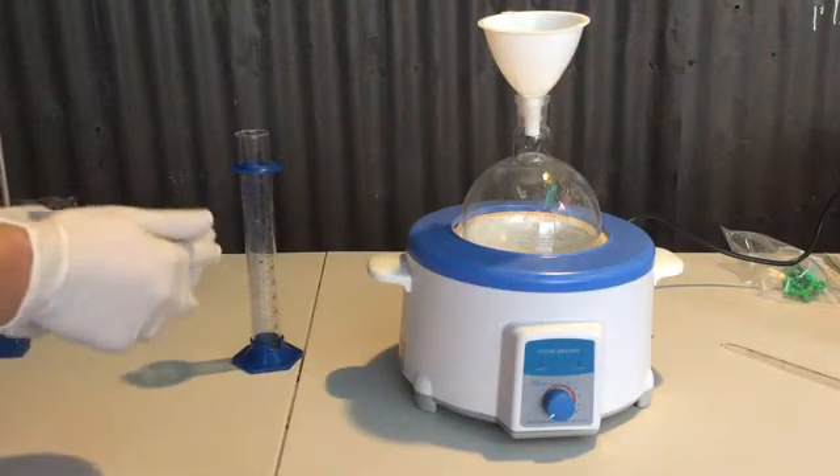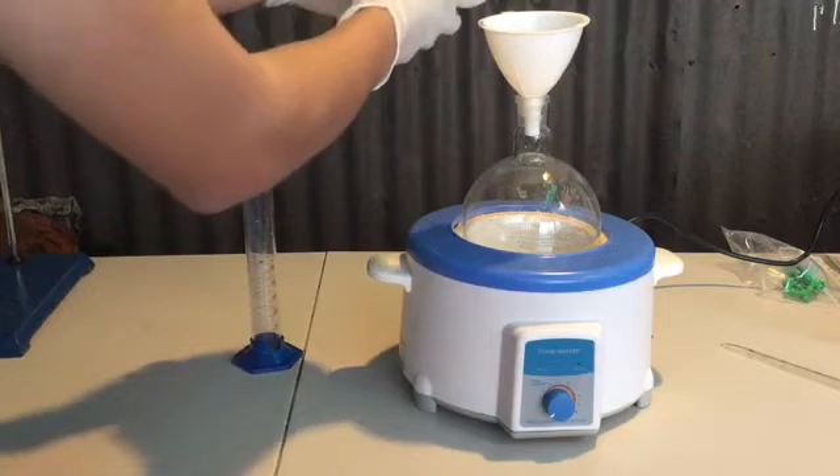However, you can see that my arms are exposed, which is not very wise, and they should be covered as well.